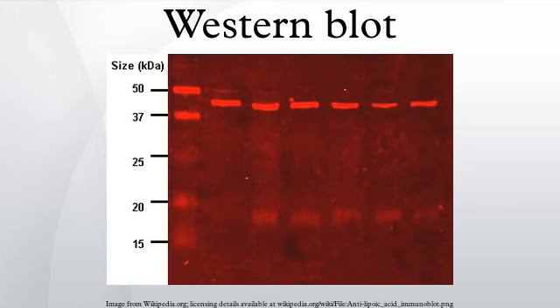It is also possible to use a two-dimensional gel, which spreads the proteins from a single sample out in 2 dimensions. Proteins are separated according to isoelectric point in the first dimension, and according to their molecular weight in the second dimension. Transfer. In order to make the proteins accessible to antibody detection, they are moved from within the gel onto a membrane made of nitrocellulose or polyvinylidene difluoride.